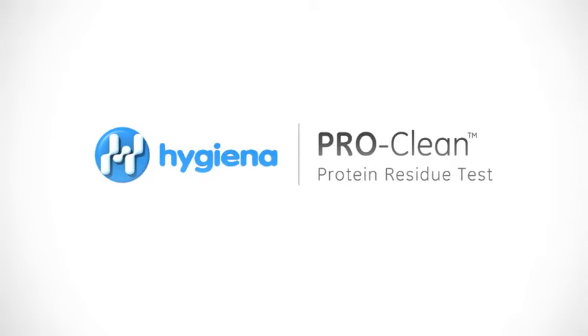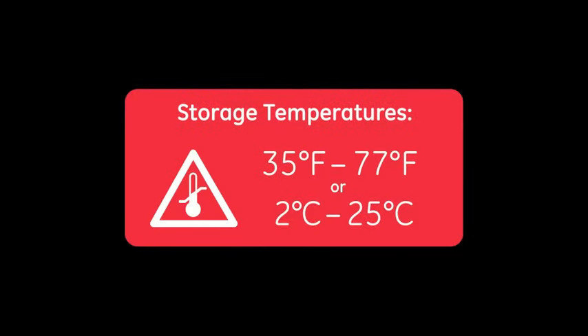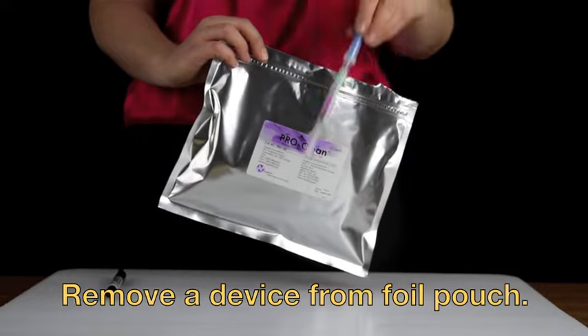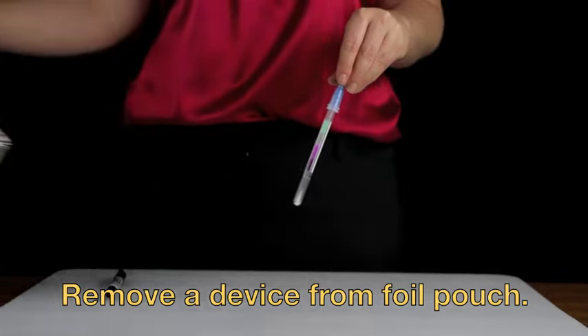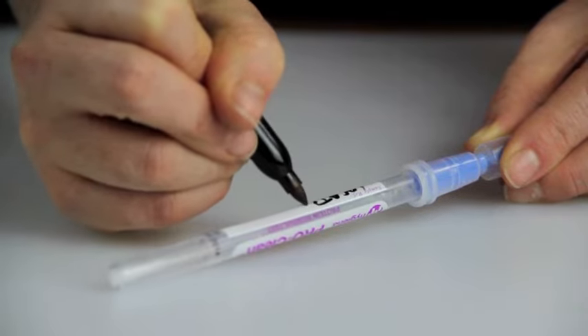This instructional video will demonstrate the proper use of Hygiena's ProClean Protein Residue Detection Test. If ProClean is kept in cold storage, let the test acclimate to room temperature before testing begins. Remove a device from the foil pouch. You may choose to write the test location or time of the test on the label for easy identification.